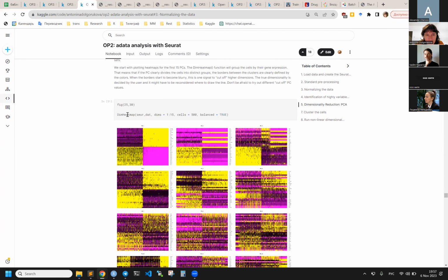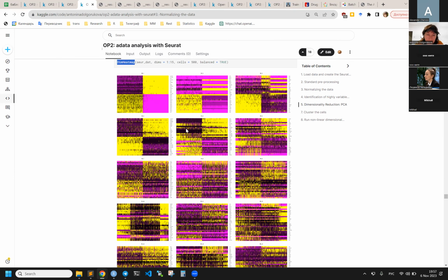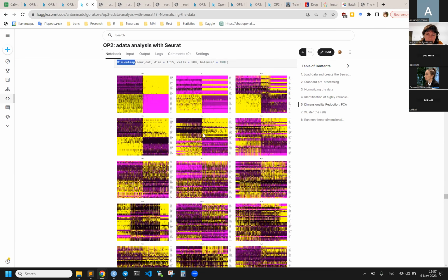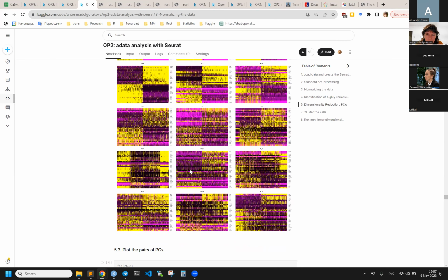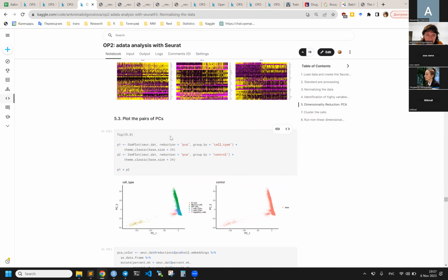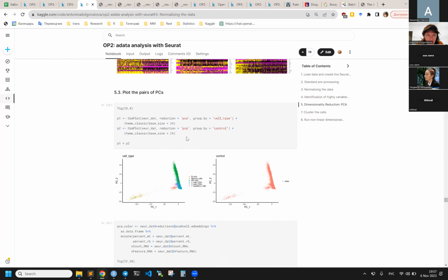Another way is to construct a heat map, and the better we see borders between these clusters, the better this principal component explains variability in the data. So from this, I would say 4 is enough. These 4 are good; the others are blurry and not informative. Anyway, it's your choice. You can pick any number based on your subjective opinion. There is no rule.